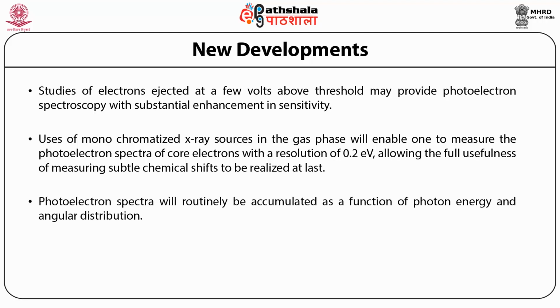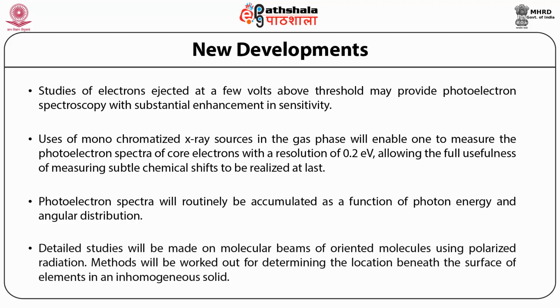Photoelectron spectra will routinely be accumulated as a function of photon energy and angular distribution. Detailed studies will be made on molecular beams of oriented molecules using polarized radiation.